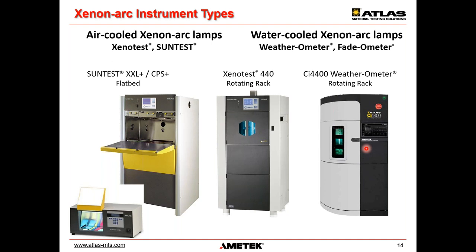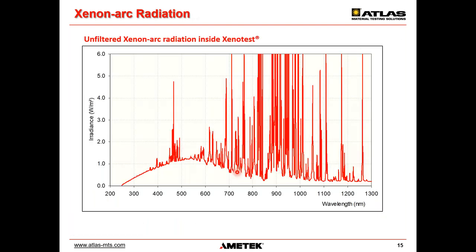purposes. And the air-cooled lamps are inside the Suntest and the Xenotest instruments. Maybe one note, the type of cooling itself does not have a major influence on the spectral power distribution. This is just different technology. What really is important is shown here.